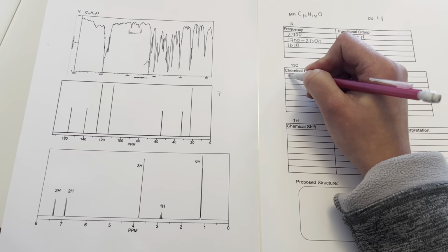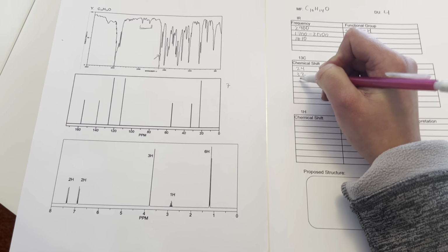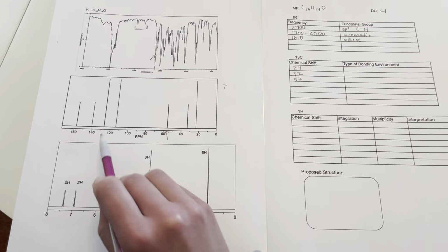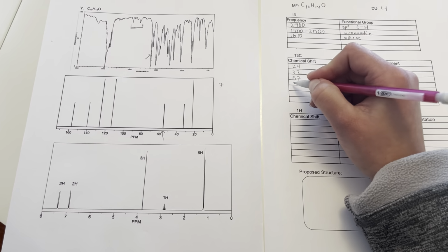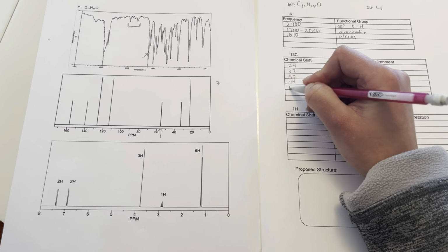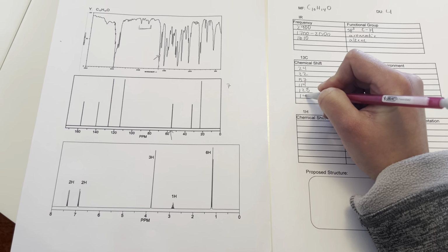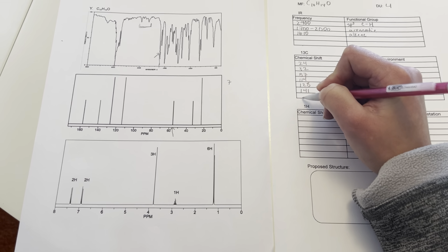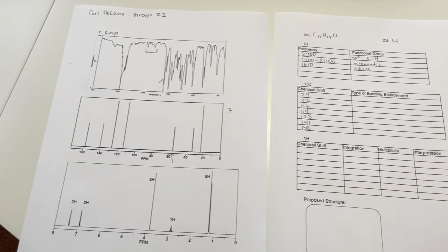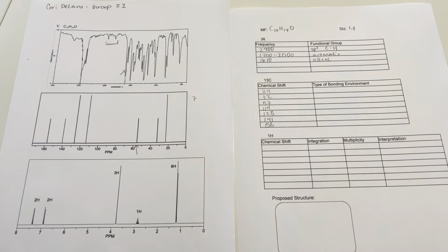I see 24-ish, 32, 57, 114, 128, 141, and 158. These are all estimates.